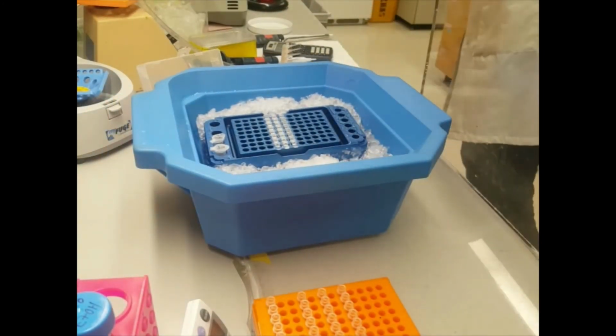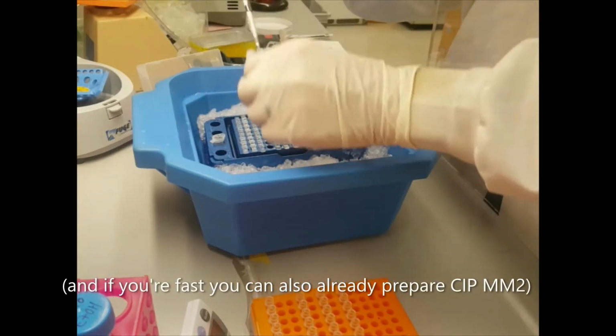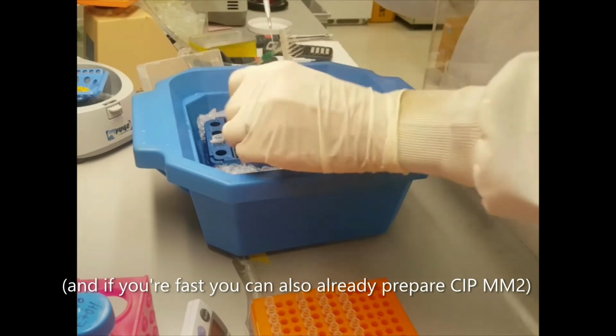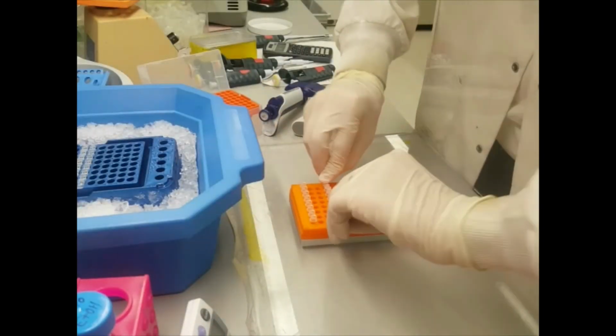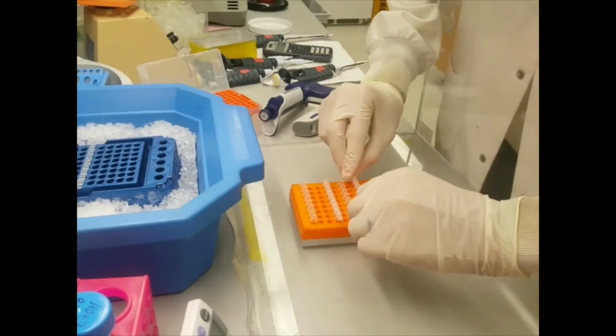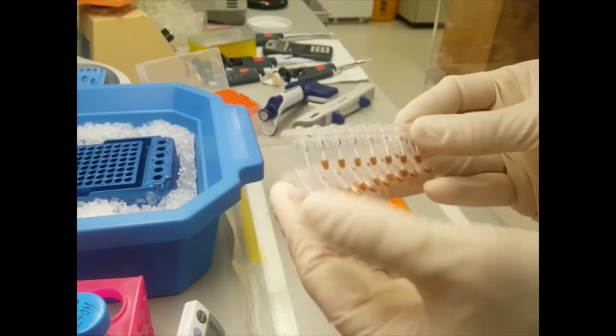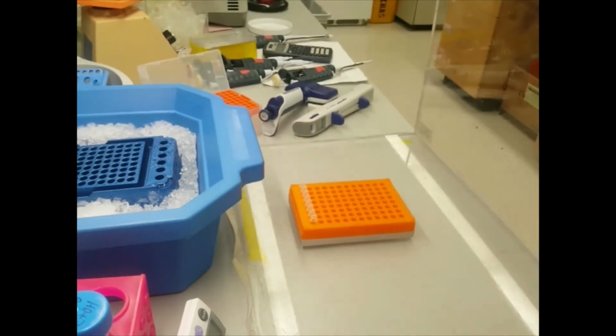While the beads are drying, prepare lids that contain per sample 10 microliters of TET. Following the 3 minutes, place the lids with the TET onto the tubes and make sure that the beads nicely resuspend. This may take 3 to 5 minutes.